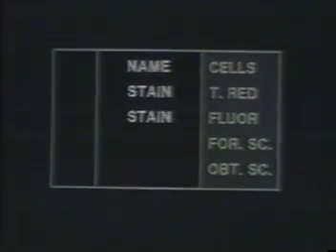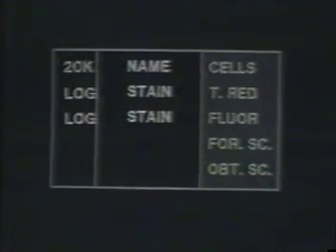In a moment, we will watch Tom instruct the Magic Secretary to collect data for 20,000 cells per sample. He'll then indicate that his FACS amplifiers are set to collect logarithmic data for both fluorescence channels and linear data for both scatter channels. Tom only has to adjust these figures for his first sample. The Magic Secretary will then use the same left-hand column for each successive label unless he indicates otherwise. To begin actual data collection, Tom will once again press execute.